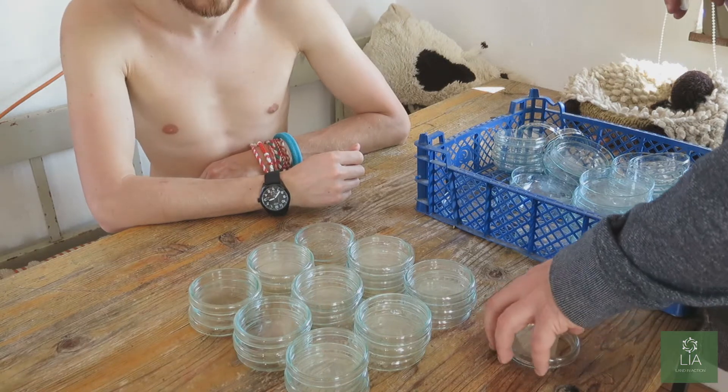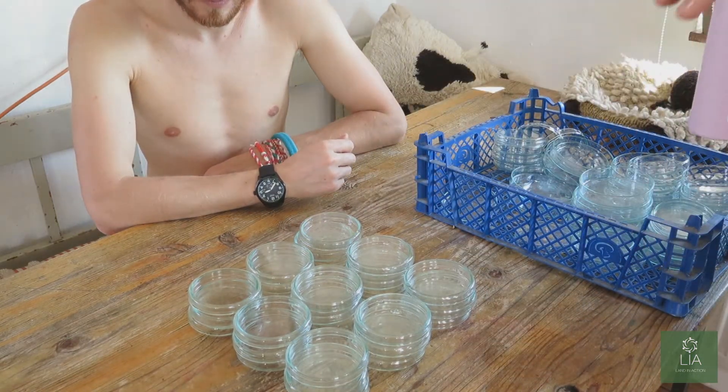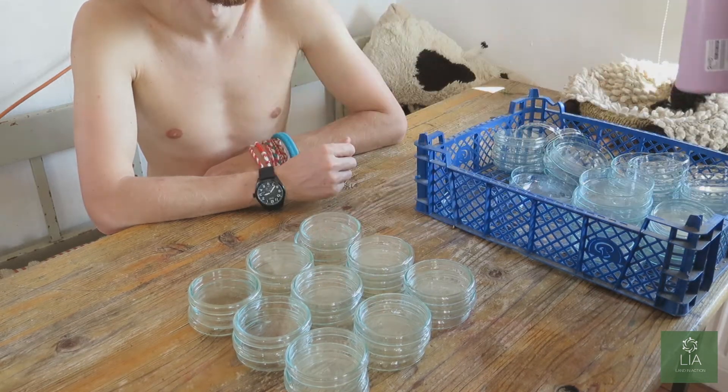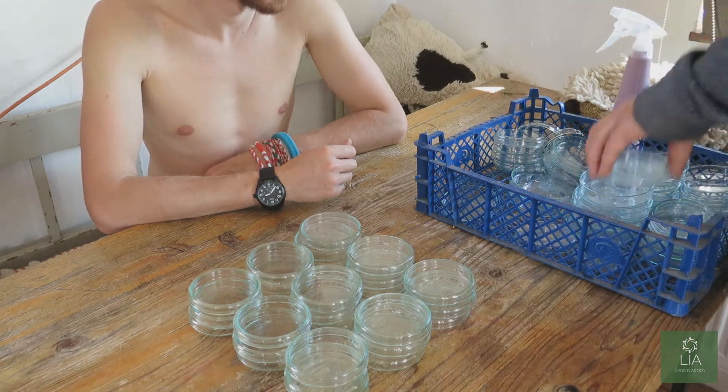Now you'll see that we're stacking the Petri dishes in stacks of three. This is just an easy number to work with when you're moving, filling with agar, closing, moving, filling with agar, closing. You'll see it when I get to that stage.